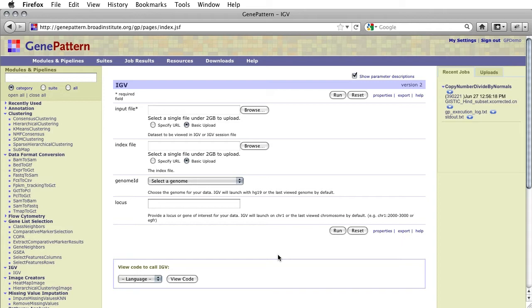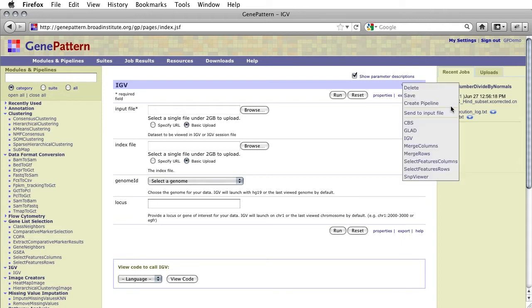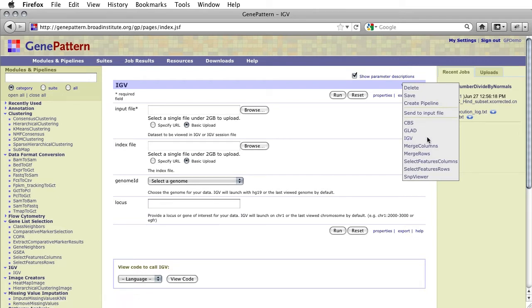As previously mentioned, launching IGV from GenePattern allows you to pass your GenePattern result files directly to IGV in the same way you would use a result file as input for any other module. For instance, you will now notice that on servers where IGV is installed, output from a run of copy-number-divide-by-normals will have IGV as a next option in the drop-down for the .cn result file. IGV also supports many other common GenePattern file formats, such as GCT and BAM. A full list of supported file formats and their descriptions is available through the module documentation and on the IGV website.